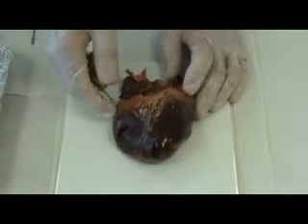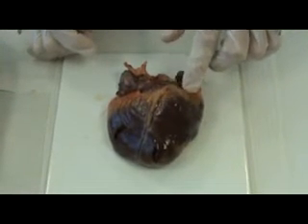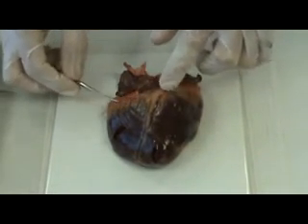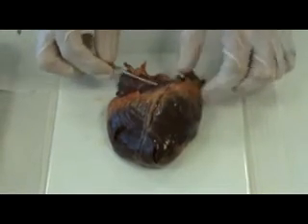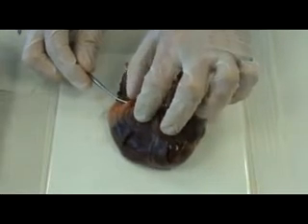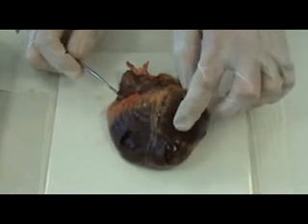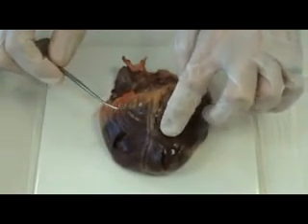Again, we can have a feel. The fat is rather tough to feel. Just poke it there. And the fat is around at the top part. It's fairly thickish compared to the size of the heart, supplying the heart with some source of energy. And the myocardium is a lot smoother and more flexible.